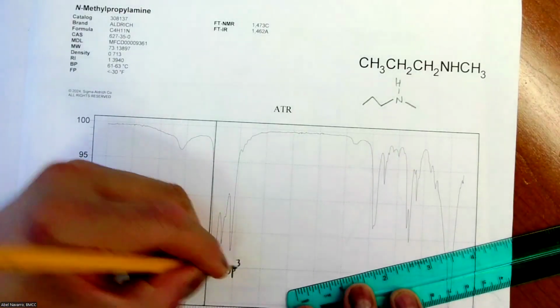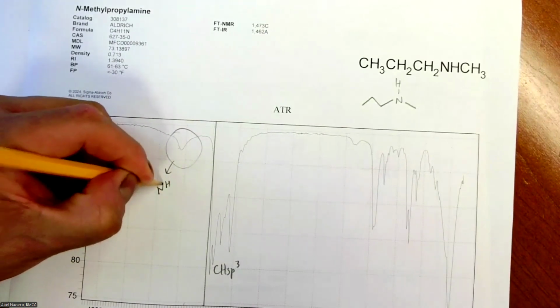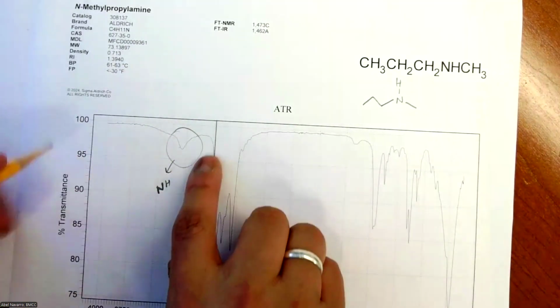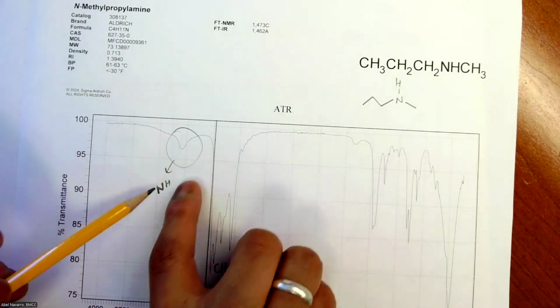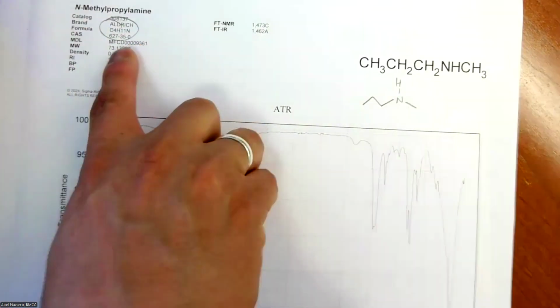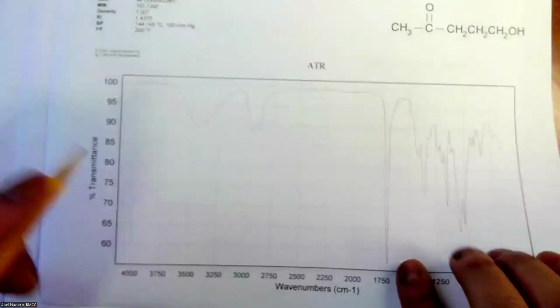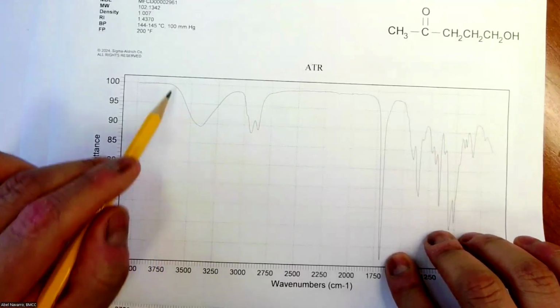CHSP3. That one is the NH. And you can definitely make a difference, right? You can tell that this is an NH and not an OH. First, because your formula has no oxygen. That's clear. And second, because the OHs have a really round and broad peak.